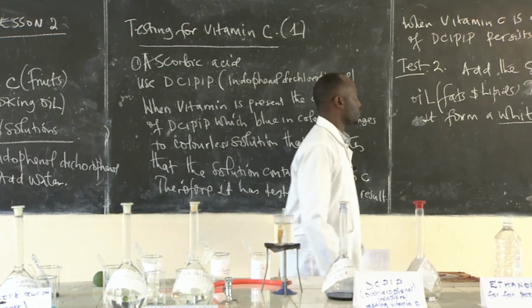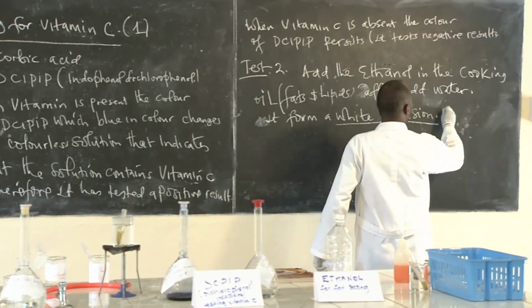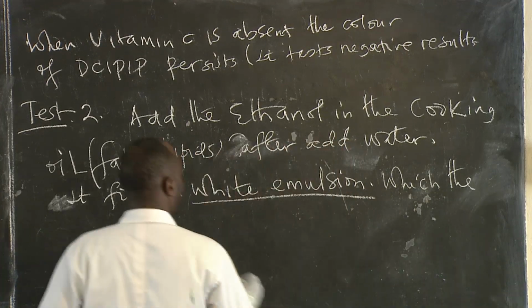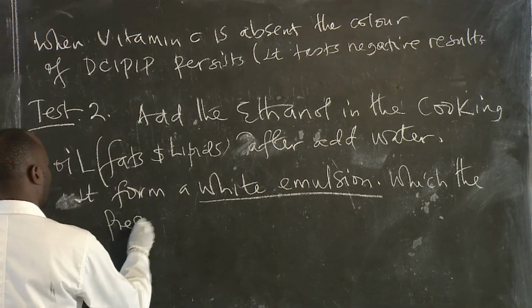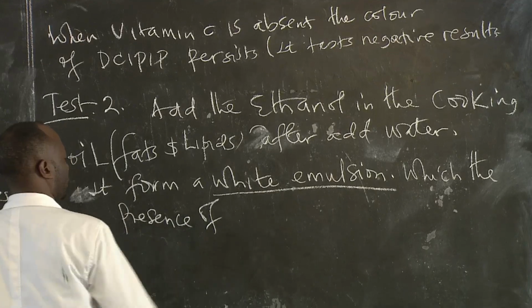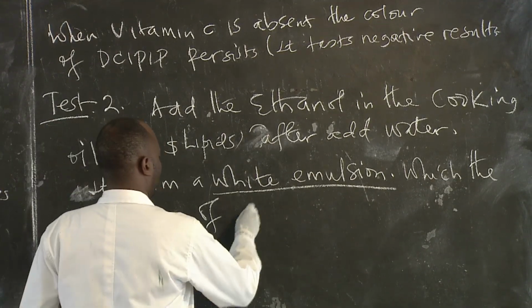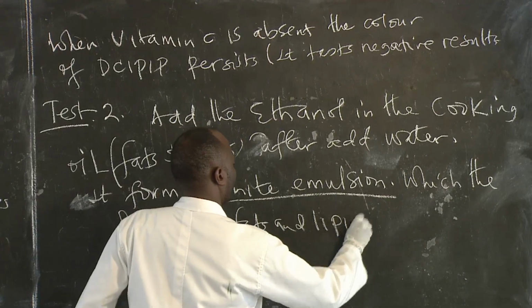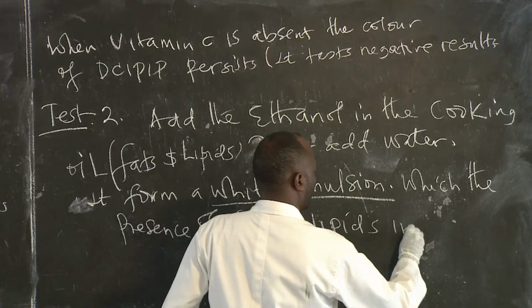So this one confirms positively the presence of fats and lipids in the food sample.